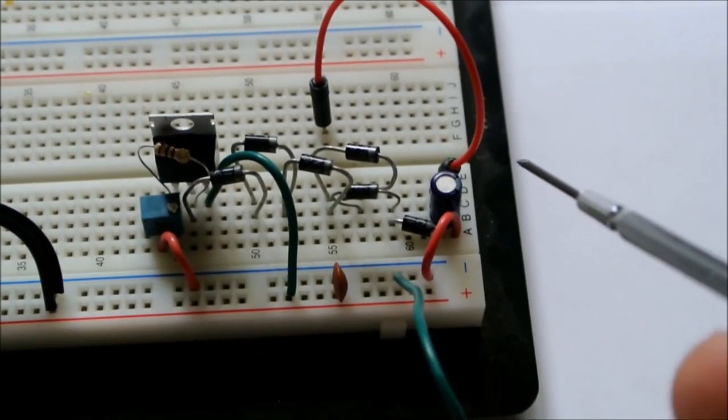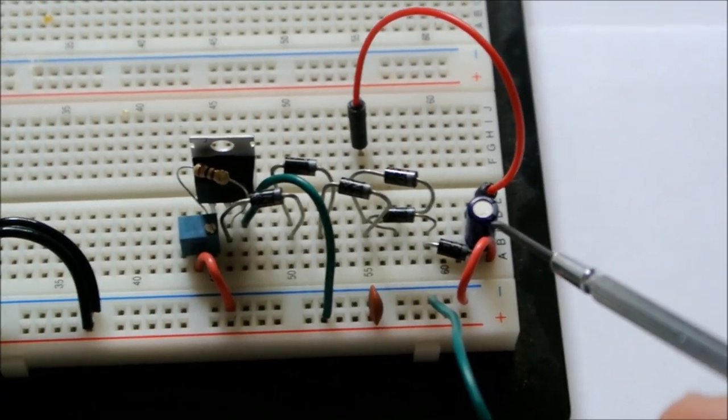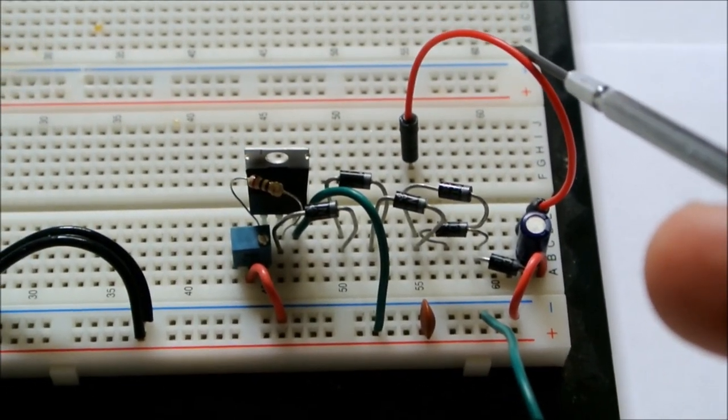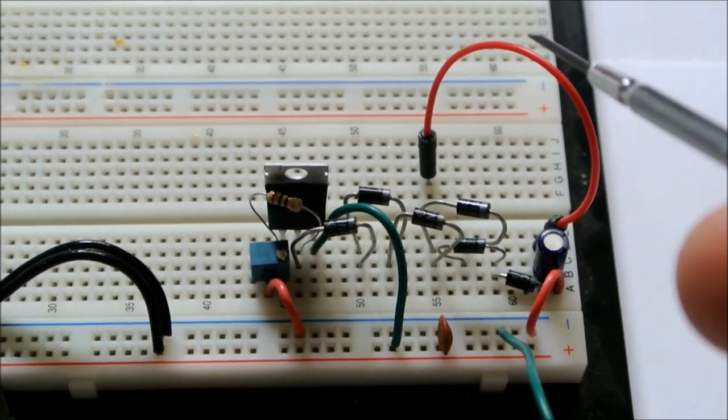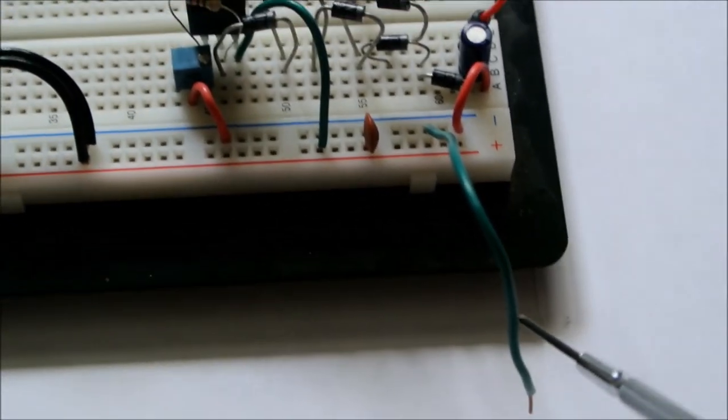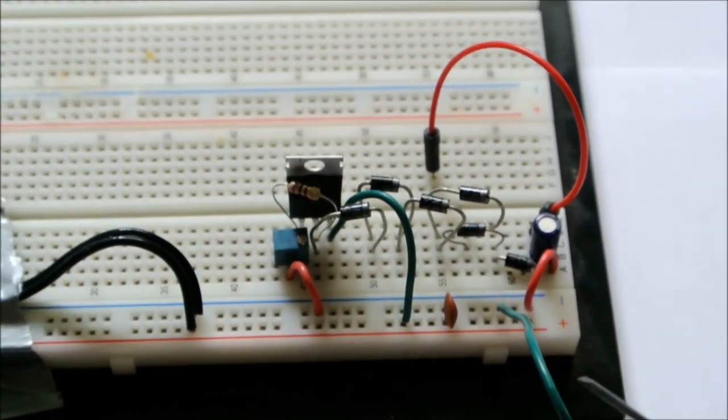I have this one microfarad 50 volt capacitor just for smoothing the output, and then this red wire goes to the anode, and this green wire, the ground, goes to the cathode where tin metal is deposited as crystals.